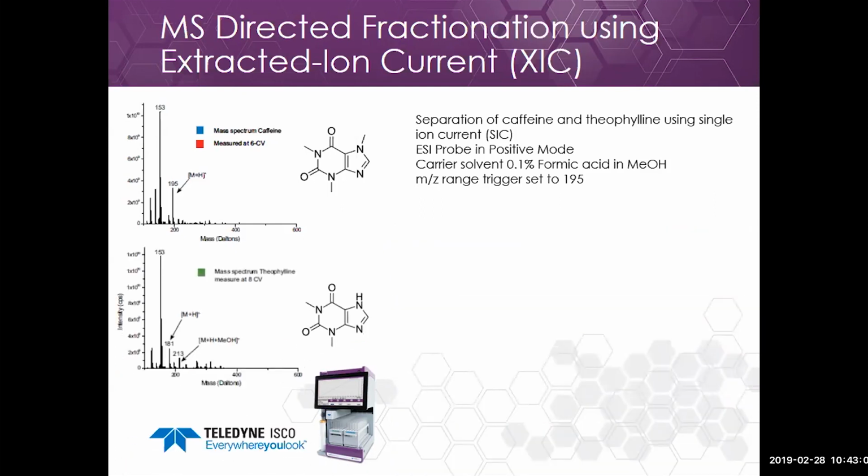So we're separating it from the theophylline, which is a very similar compound. It's just not methylated at the amine.